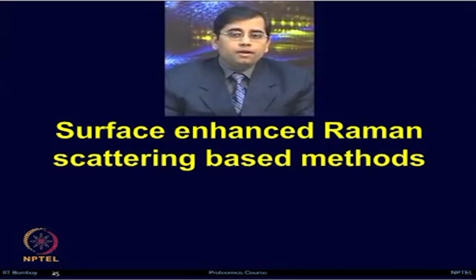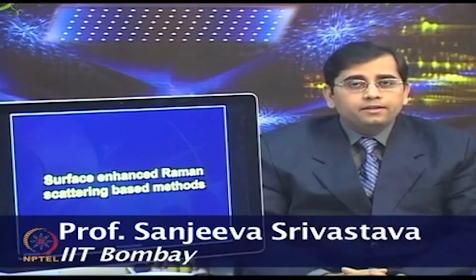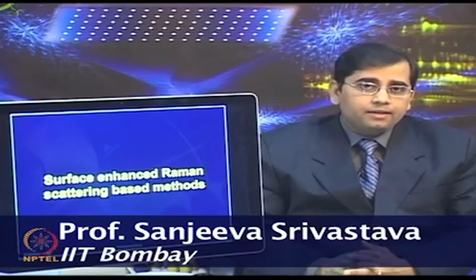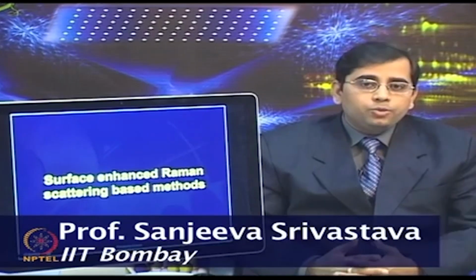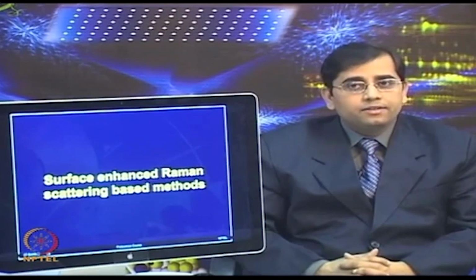Light which is incident on an atom or molecule is scattered back with the same energy and same wavelength. That is a generic phenomenon. However, the Raman effect prevails in a small fraction of photons where the energy of a scattered photon is different from the incident photons. Therefore, improved optical properties are obtained because of the enhanced electromagnetic field at the surface of the particle, which is detected by using spectroscopic techniques such as SERS or surface enhanced Raman scattering.